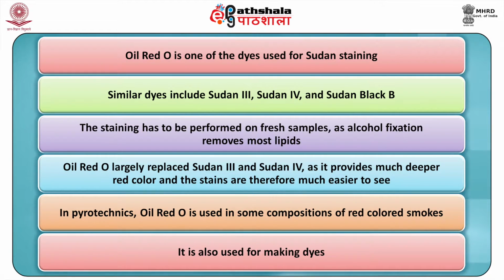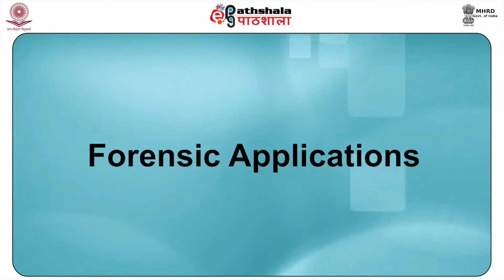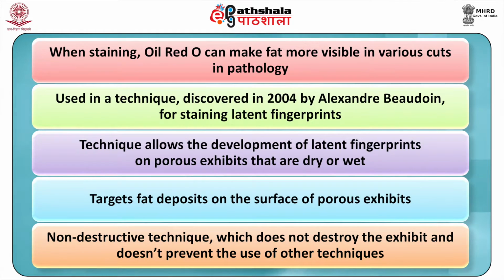In pyrotechnics, oil red O is used in some compositions of red colored smokes. It is also used for making dyes. Now, let us have a look at the forensic application of this dye. When staining, oil red O can make fat more visible in various cuts in pathologies. It is also used in a technique.